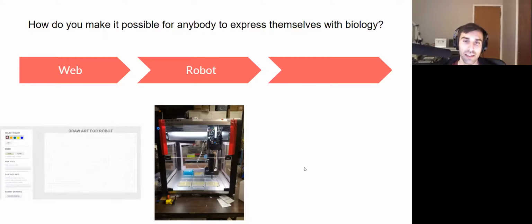The second one is this idea of using robotics to actually help. A lot of work is coming out of this lab at Stanford here. Basically, the idea is we have telepresence in a lot of other aspects of life. We've all been on Zoom, I think, a fair bit in the past year.